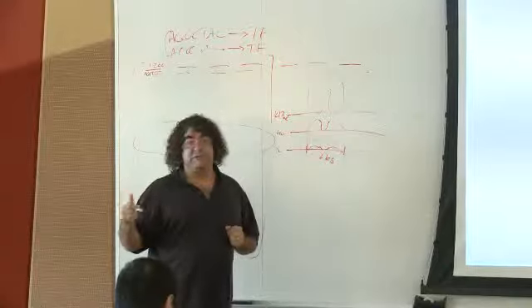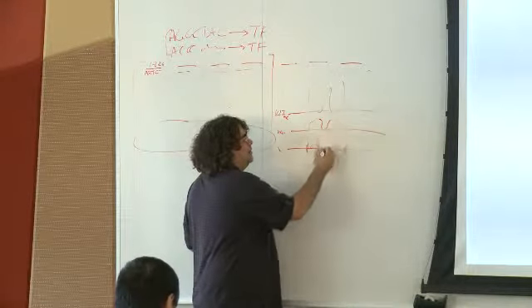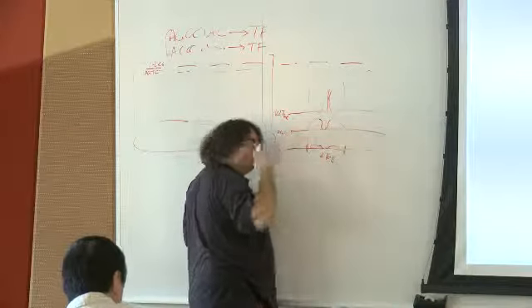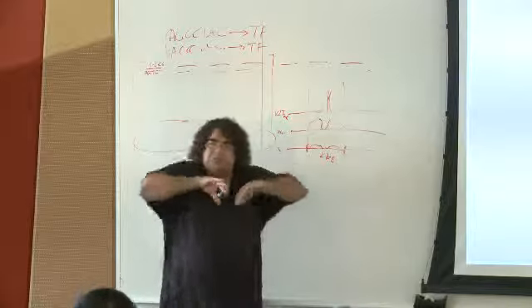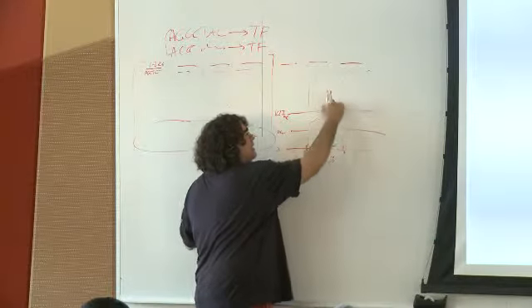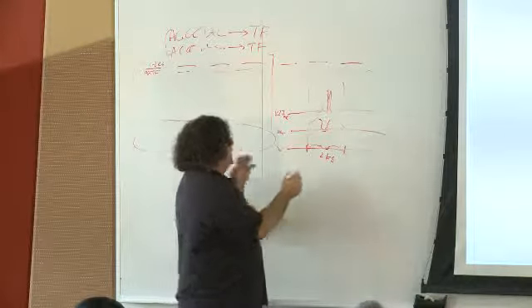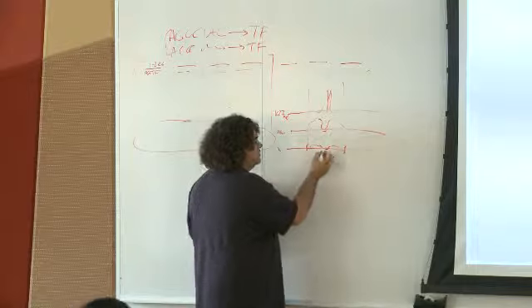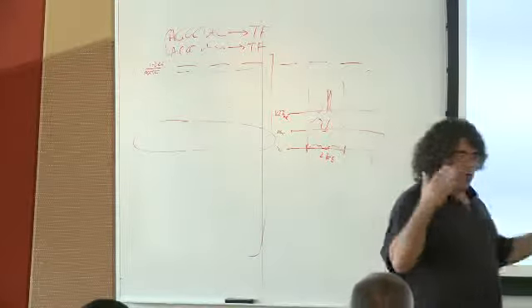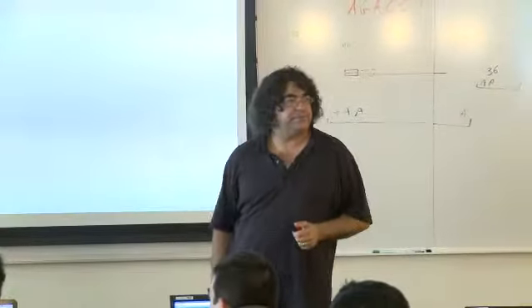One interesting thing though is the motifs seem to occur in places that are slightly more conserved in evolution, which is not very surprising. And they also correspond to dips in the histone map. Even in the K27, the place where the transcription factor binds, it leaves room, so it's pushing the nucleosomes aside. So there is a dip in the signal in all of these tracks, and a peak in another assay that's testing for how open DNA is. So there is big interest in this, because this is probably where the motif is. These dips are considered a good way to hone in exactly within that element on the part where you have the binding and the activity going on. Okay?